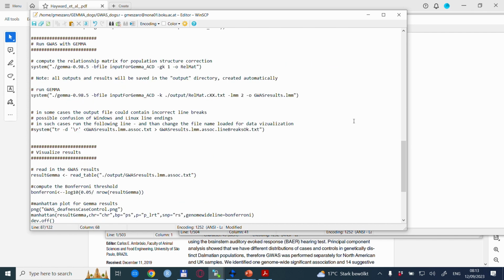And in the next step, we are actually already at the GWAS run, and considering how much time we spent already on all the explanations and preparations, this is almost like an anticlimactic outcome, because it's just so simple. So basically the whole GWAS with GEMMA in this very simple and very basic form is the following.